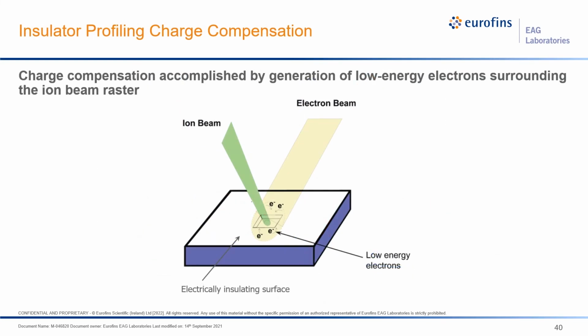Now let's look at some insulating materials. For us to be able to do proper SIMS analysis, we need to use low energy electron beam irradiating the vicinity of the analysis area to neutralize the charge buildup. However, depending on what type of electron beam you use, you may actually create more problems than you started with, especially in mobile ion analysis in SiO2 dielectrics.